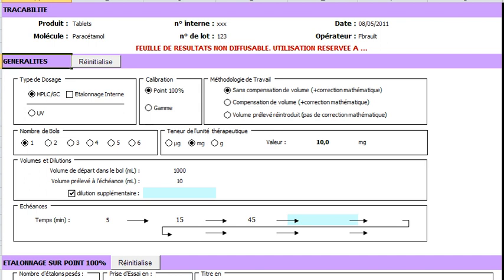Here we select whether the calibration is just a 100% point or a calibration curve. As a consequence, the display of the bottom will be affected and a specific area will appear.